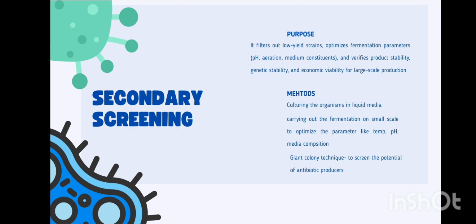Next type of screening is secondary screening. After performing the primary screening and selecting the organism, the next step is to find out the true potential of the organism isolated during the primary screening. This is done through a process called secondary screening. Secondary screening is a type of quantitative approach.